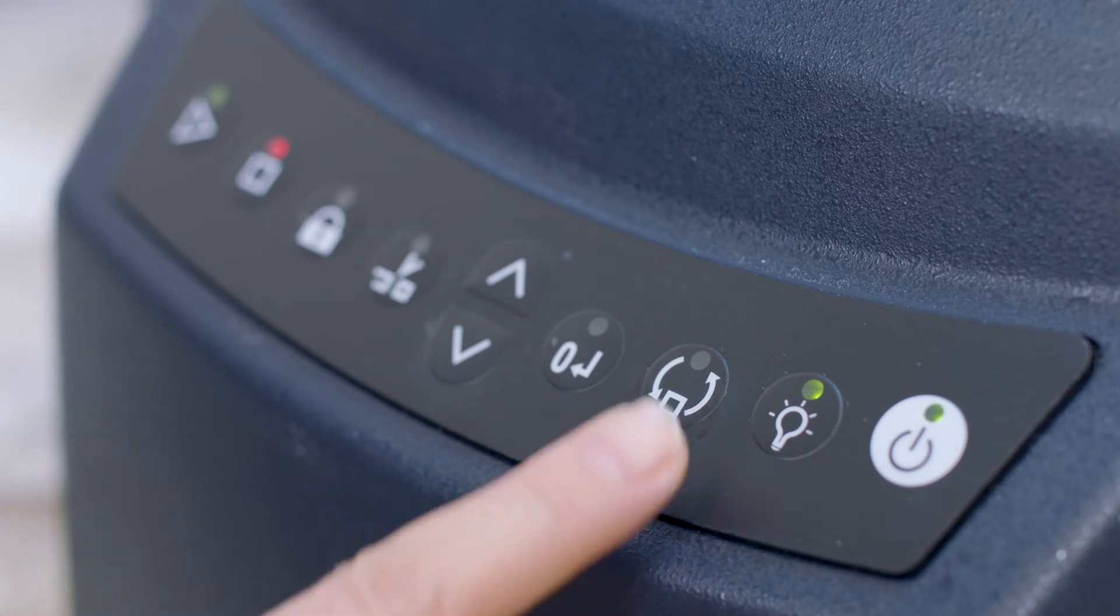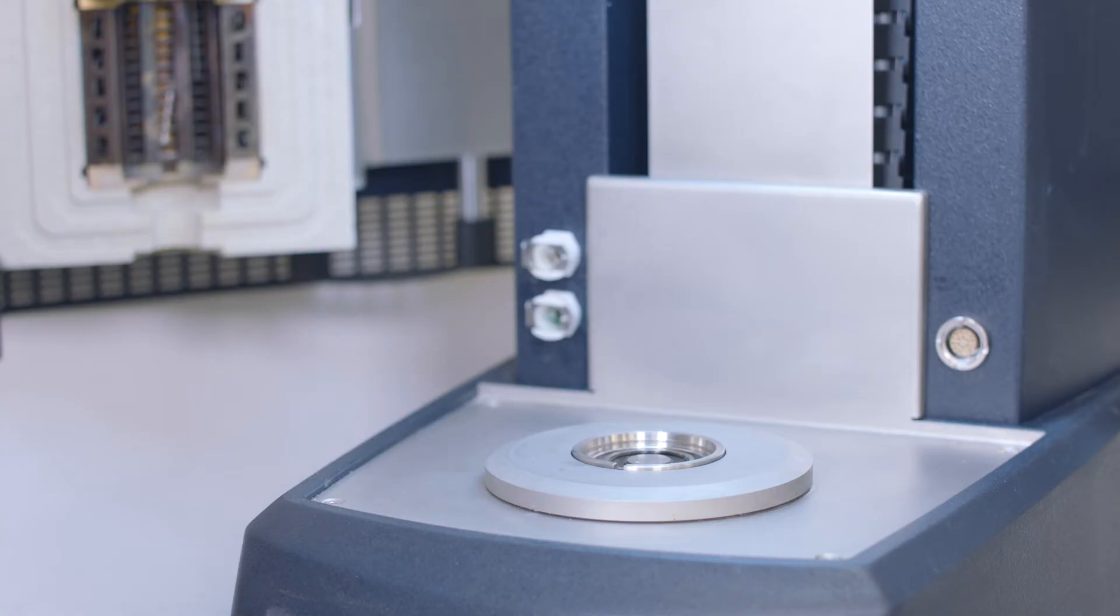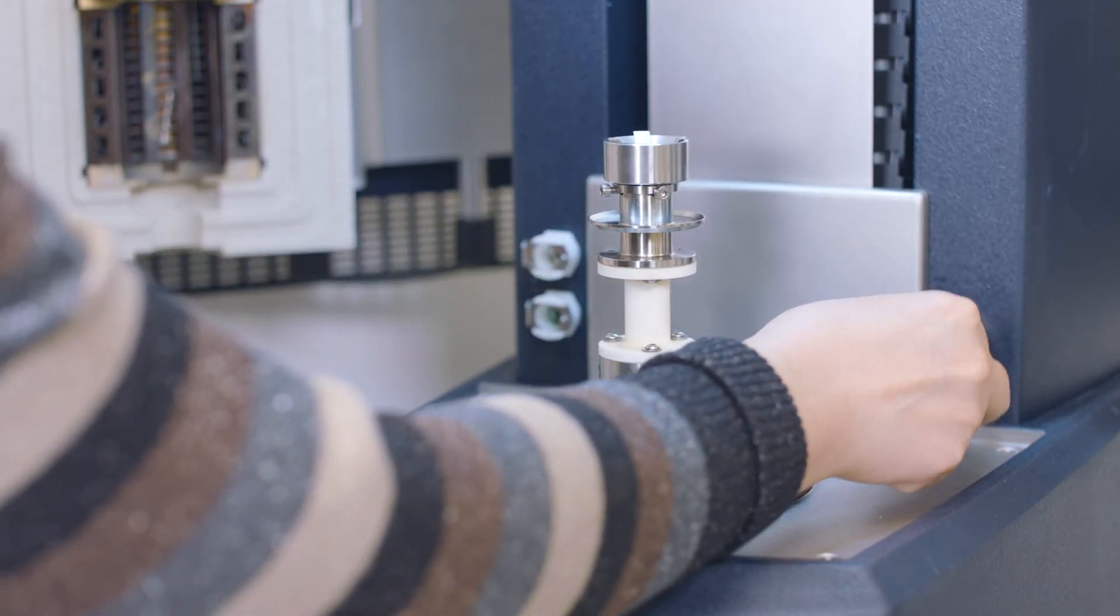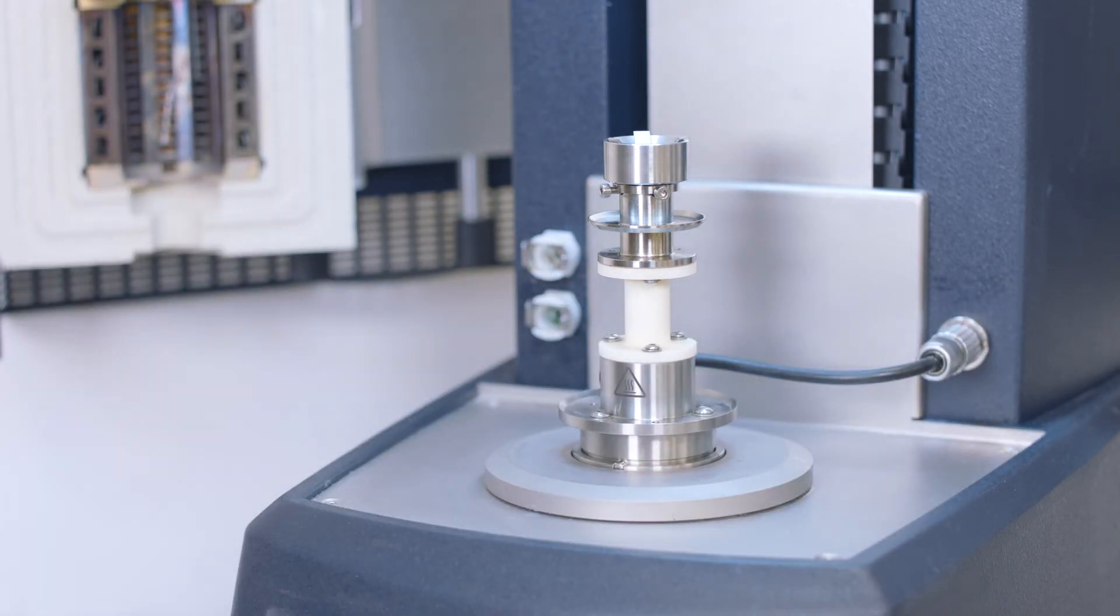From the instrument control panel, press this button to temporarily release the magnet. Put the ETC bottom geometry onto the instrument bottom stage. Then, insert the Smart Swap plug with the red dot facing up.